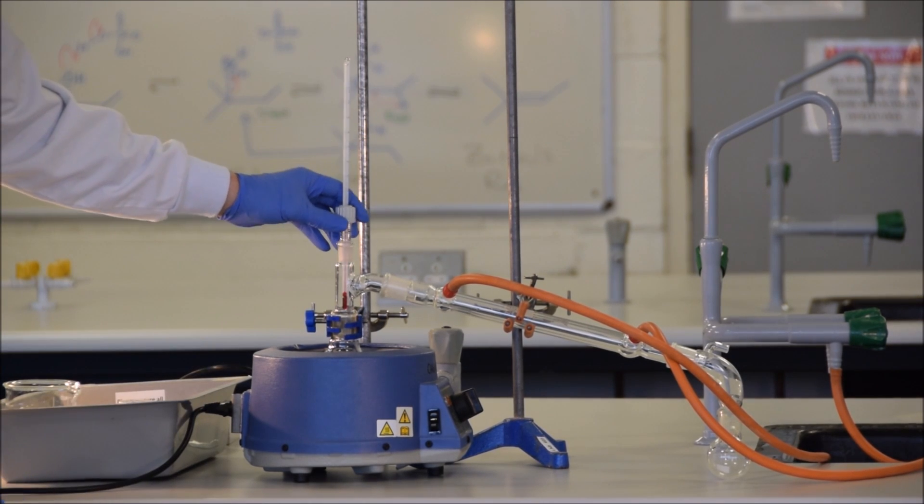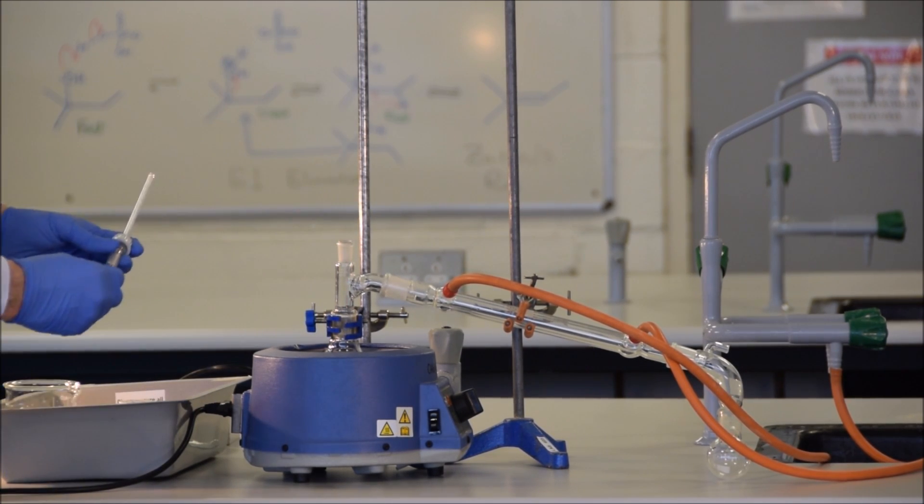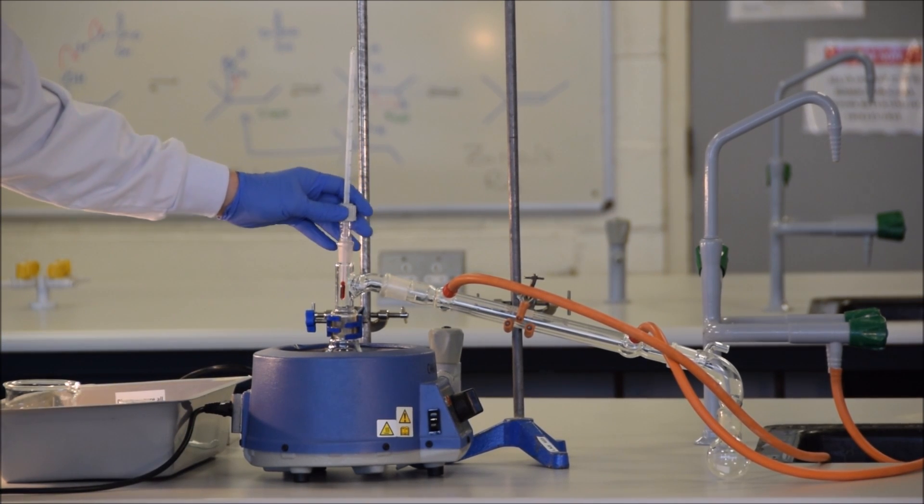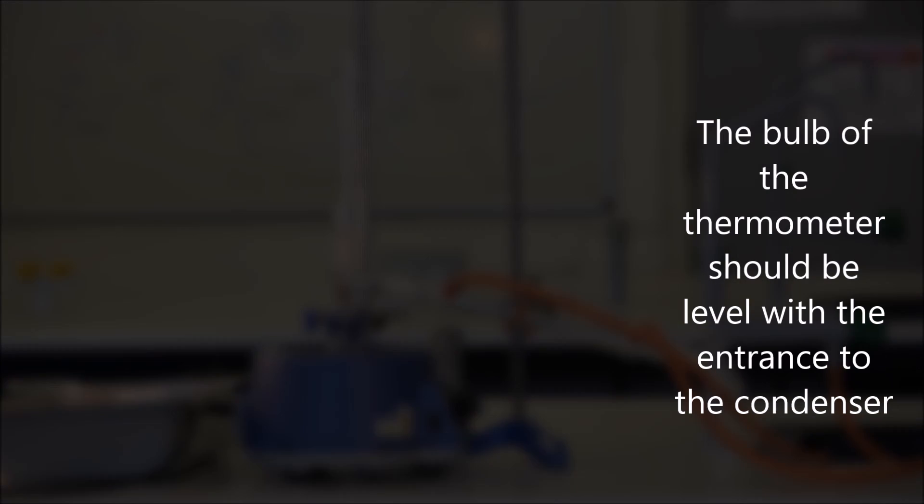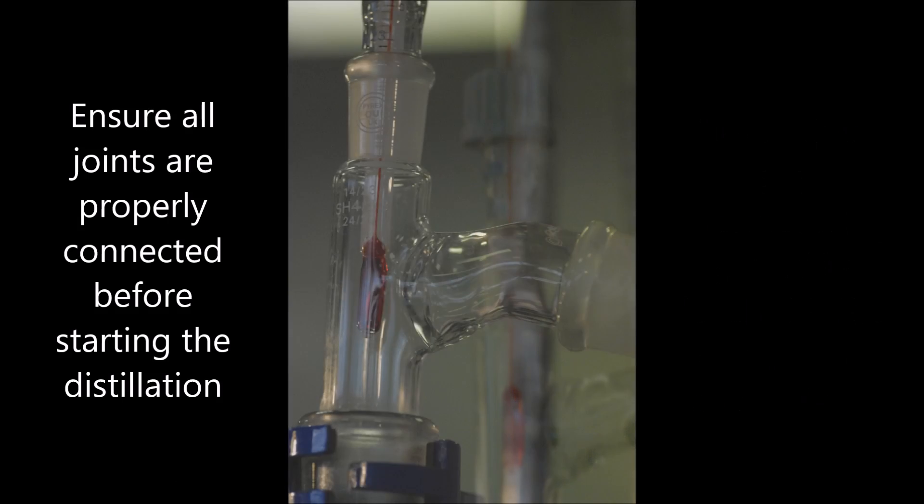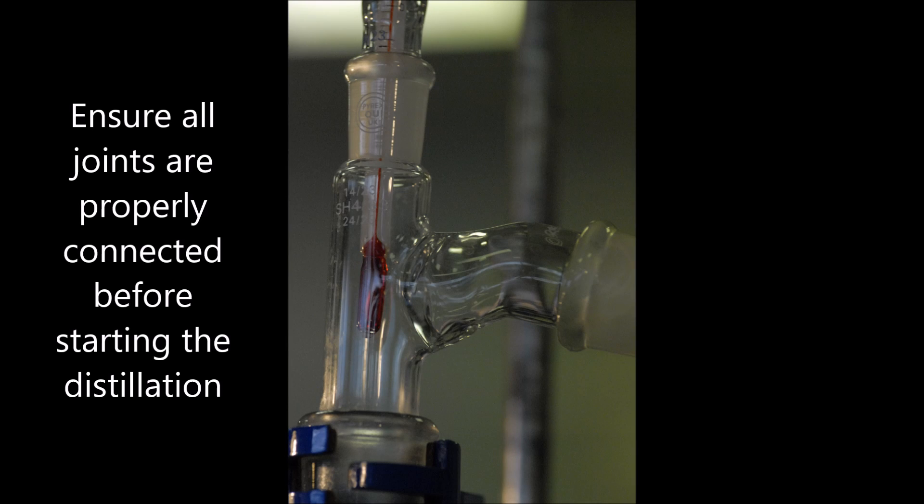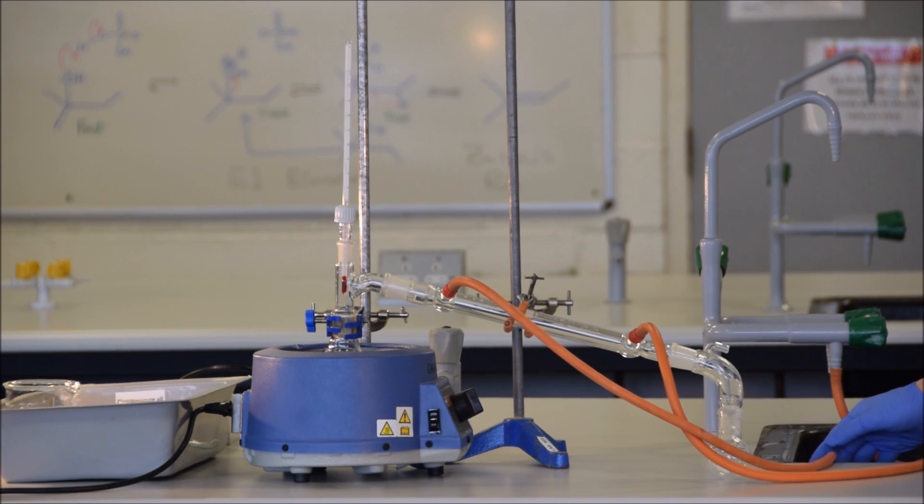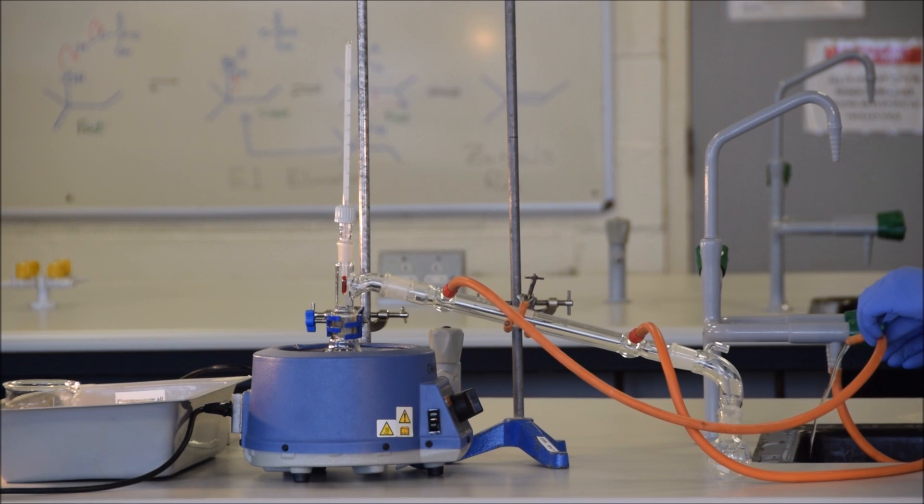The last part in this puzzle is to put in the thermometer. It's important when you put in the thermometer that you put it in at just the right position. What we're trying to measure is the gas temperature of the gas that is making it into the condenser. So we position our thermometer so that the bulb is just in line with where the gas that is entering the condenser is passing by. Then we turn our water on. Notice here the relatively low flow. And then, once we've got the flow adjusted so that it's just a trickle, we can then turn on the heat.